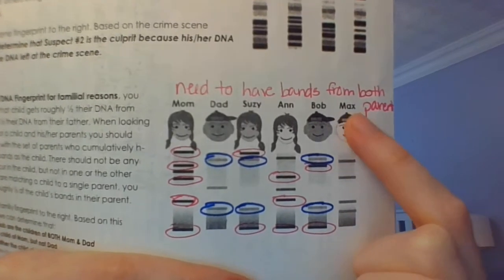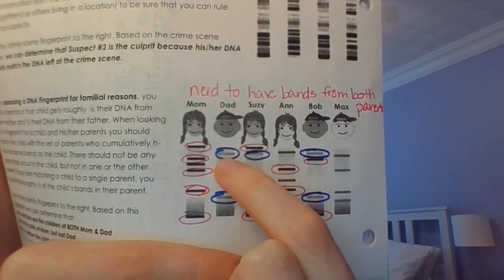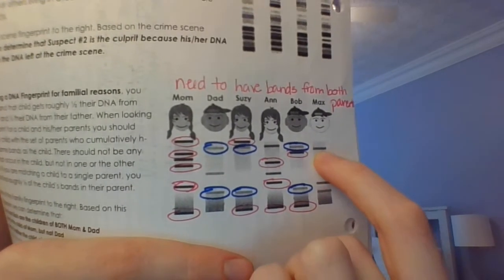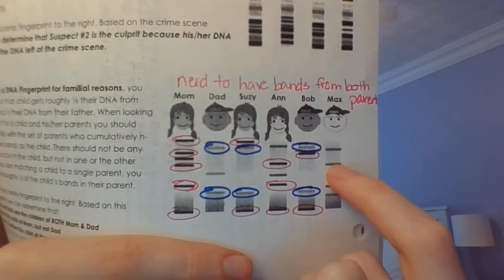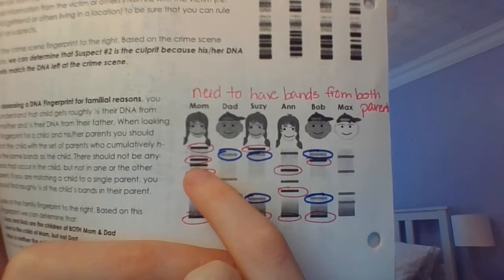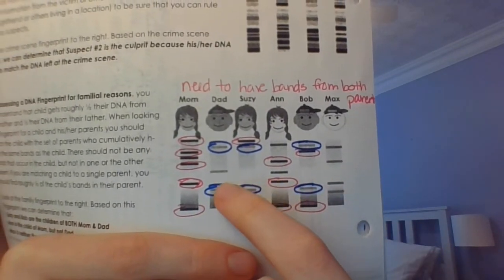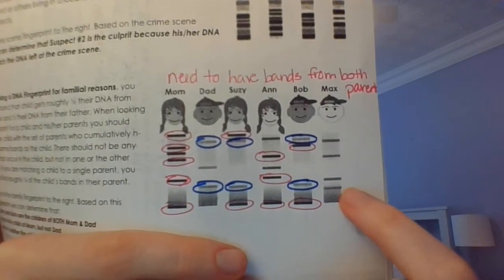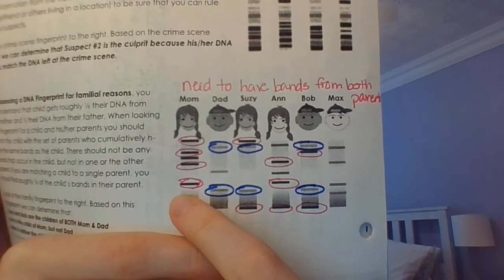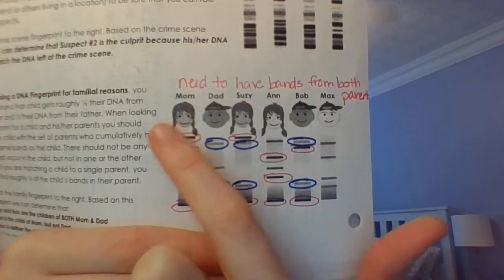And then lastly, you have Max. Max's first band's right here. The dad's band does not match it, and the mom's band does not match it. So that is neither parents. His second band, if you go over, dad does not have it, mom does not have it. Third band, dad does not have it, mom does not have it. Fourth band, dad does not have it, mom does not have it. So Max is neither the child of either of these two.